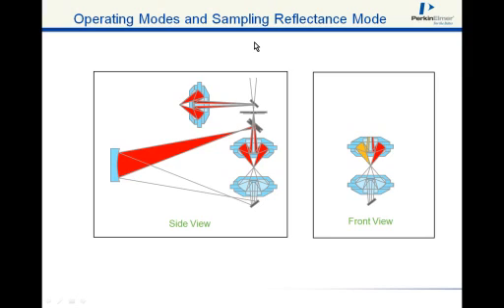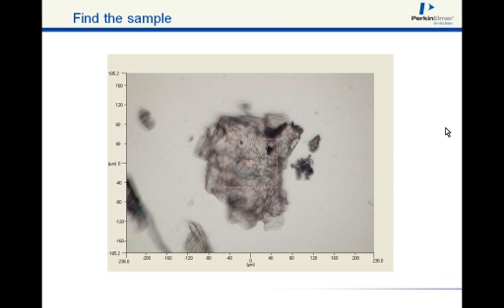The light then goes up to the camera or to the MCT detector. So in theory, you should get half as much throughput with reflection as you do with transmission. Frankly, these days, I don't see it that often. It's about the same, even though theoretically it's true.